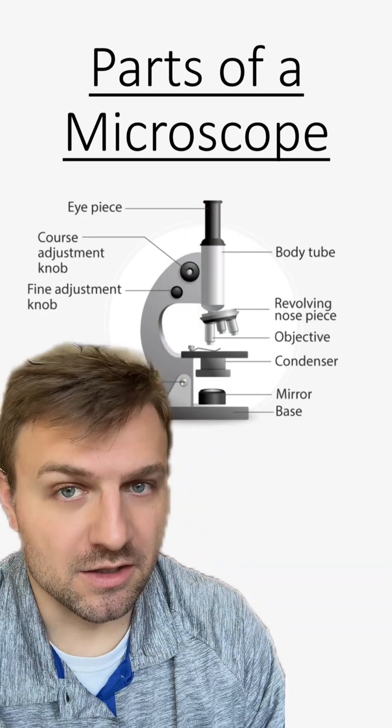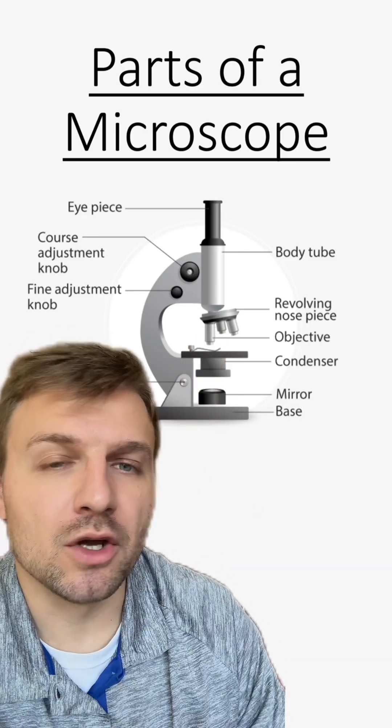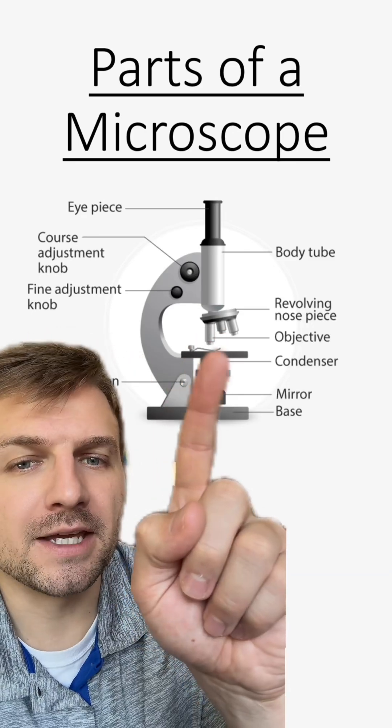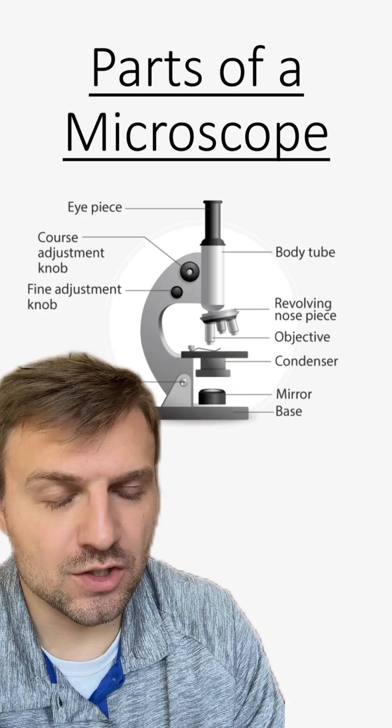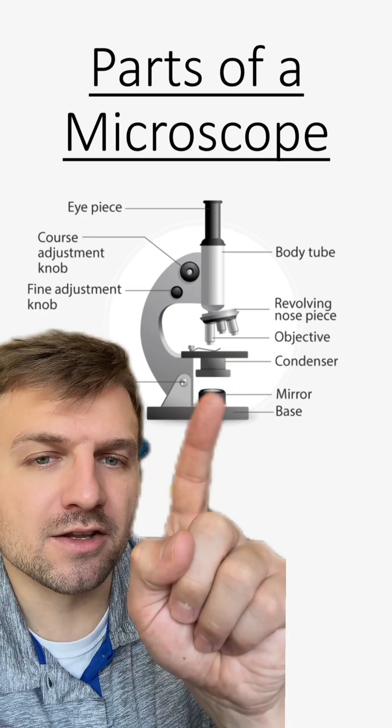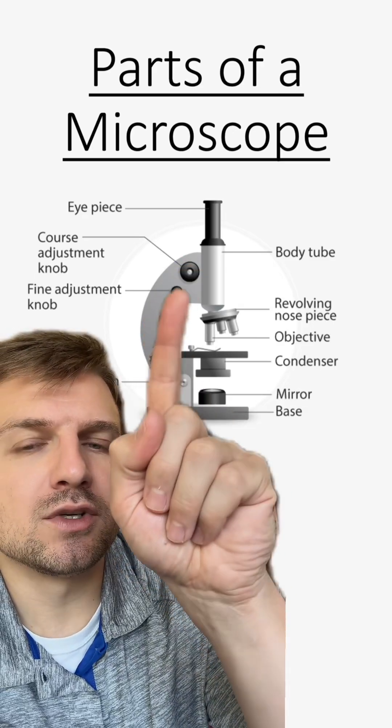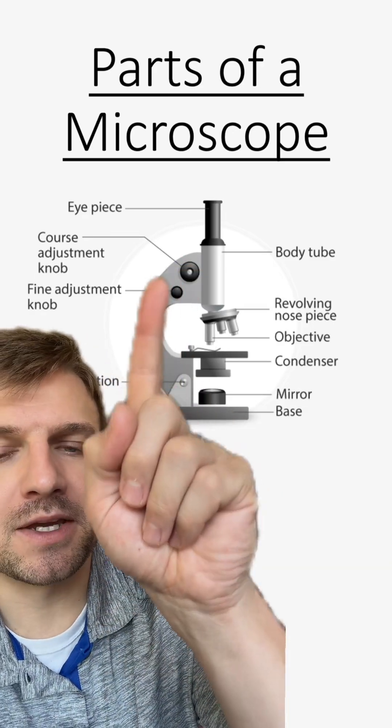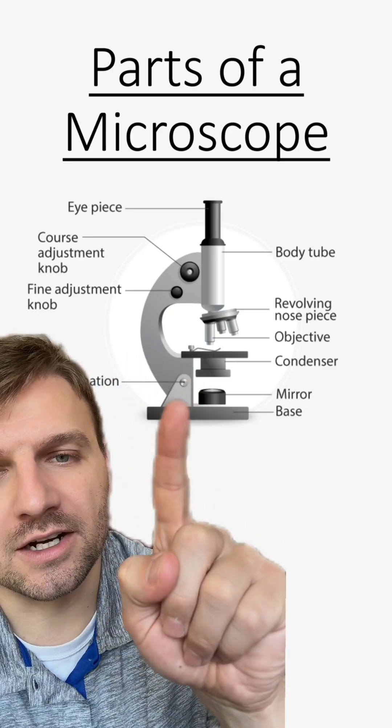First, you have your eyepiece or your ocular lens. You also have lenses down here called your objective lenses. Where you place the microscope slide is called the stage. You also have a light source down here at the bottom. And typically you have two different adjustment knobs. Sometimes they're up here, sometimes more often they're down here.